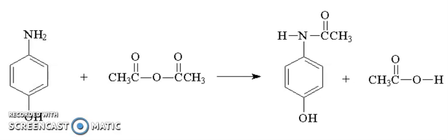Record the weights. Then, in the last step, what you need to do: recrystallize all but 100 milligram of your crude acetaminophen from water by first dissolving the solid in the minimum amount of hot boiling water. Do this carefully, adding a small amount of hot water. You do not want to have excess water. Work on a steam bath to keep the solution hot. Add another 2 ml of hot water.